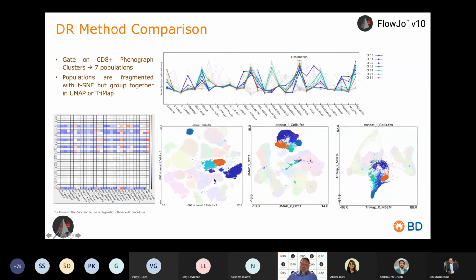but you can end up with these piled on top of each other in UMAP as well, so you can't clearly distinguish them with a gated region around an island. T-SNE flattens everything, and within an island you can say these are probably closely related cells, but you can't infer anything about the relationships between islands that are far away from each other. Just because an island is far away doesn't mean it's not related in T-SNE. In UMAP, if the clusters are far away from each other, then they're probably phenotypically different.